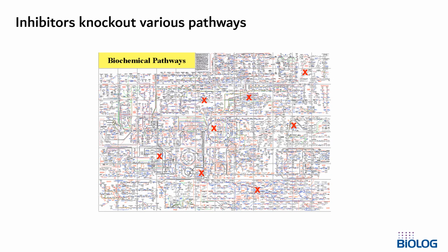The same thing is true for the inhibitor panels. We have a wide range of inhibitors with different mechanisms of action. So it's like we're poking the cell in different places to see how it responds to all those different insults.